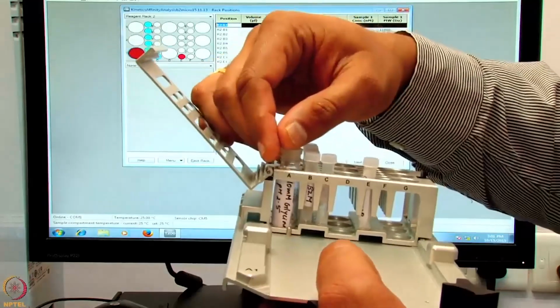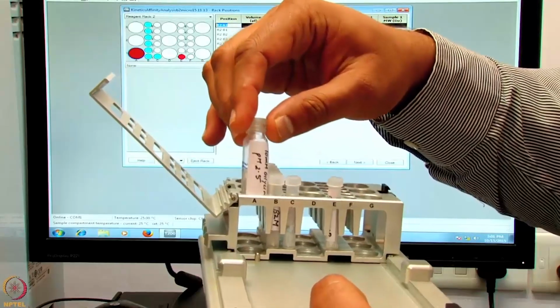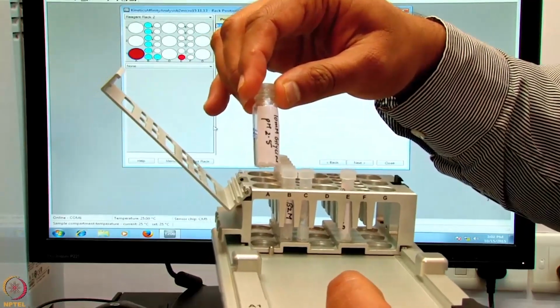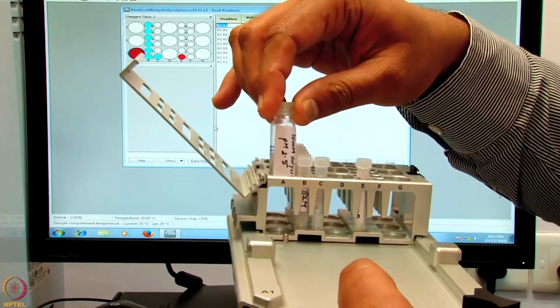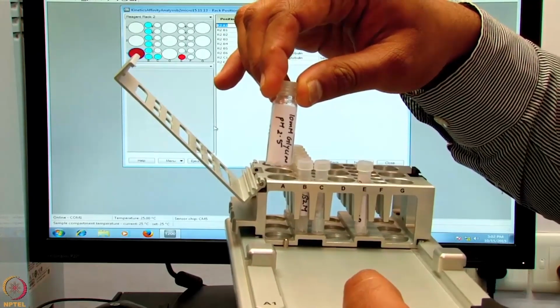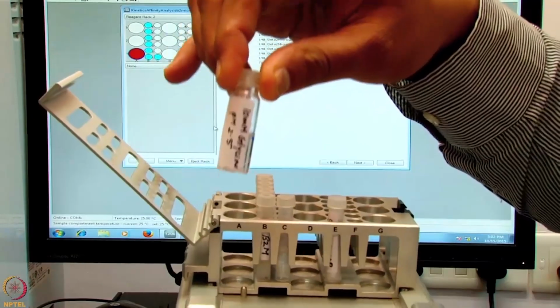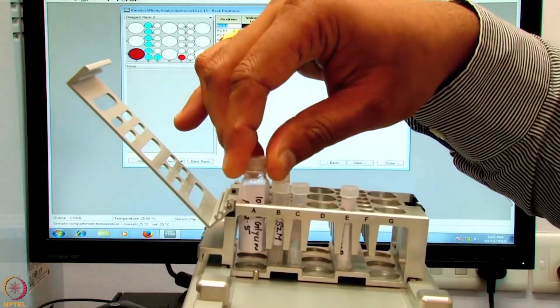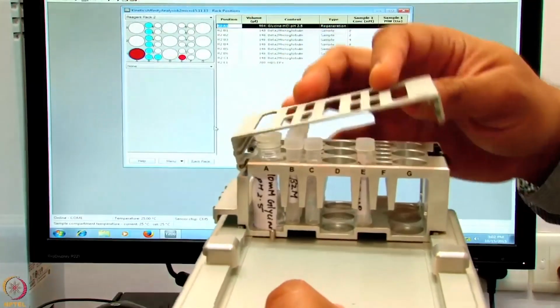Once we have placed them, we will also have glycine 10 millimolar, pH 2.5 regeneration solution put at the A1 position. Now we close the rack.